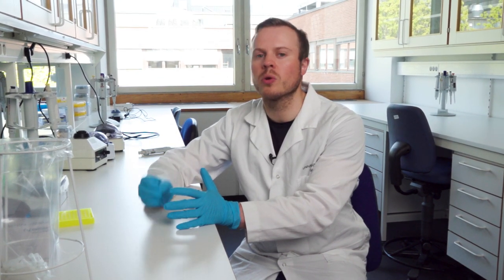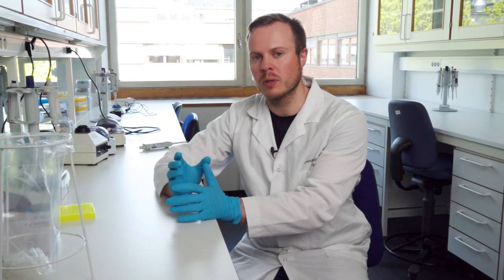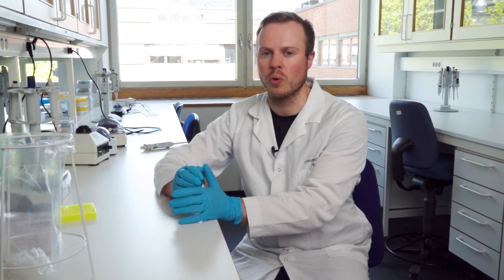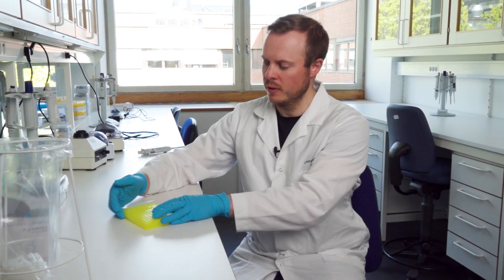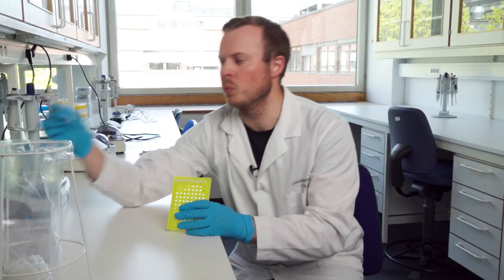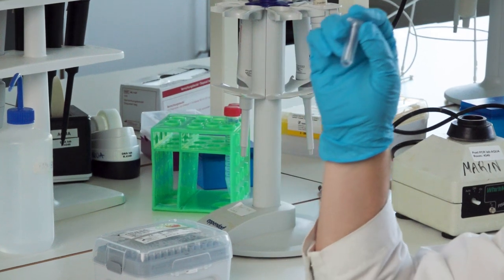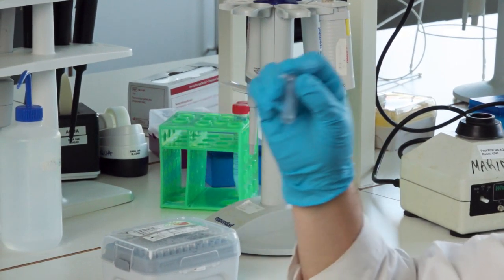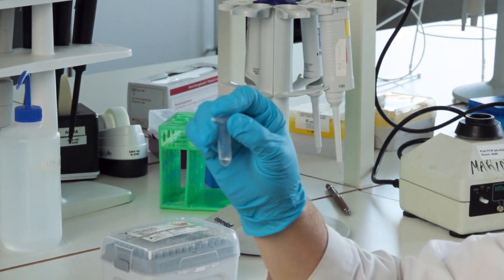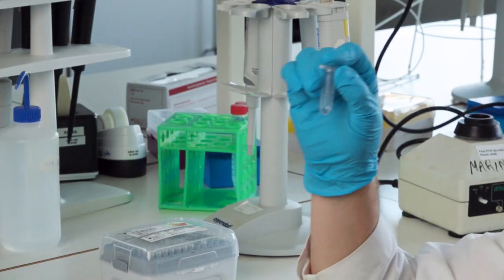But the reason why it's so important to quantify the amount of DNA is that to send it to sequencing, we need to do something that is called pooling. That means that we take all the different samples here and fit it into one Eppendorf tube. And this is possible since we have given it different barcodes in PCR2, so we can mix them and trace them back. But they need to be in the same equimolar amount.